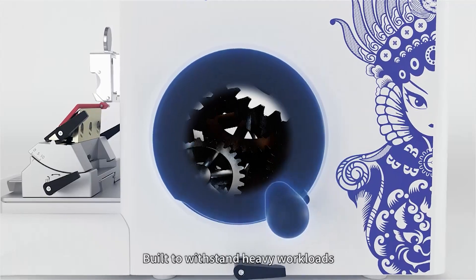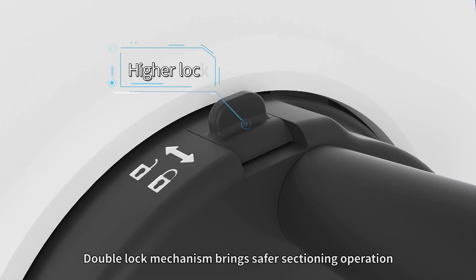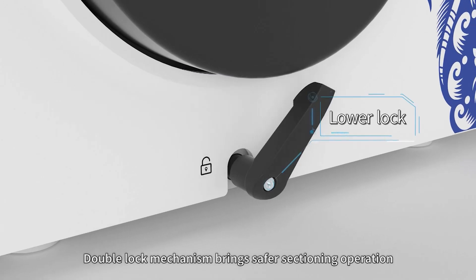Built to withstand heavy workloads, the double-lock mechanism brings safer sectioning operation.